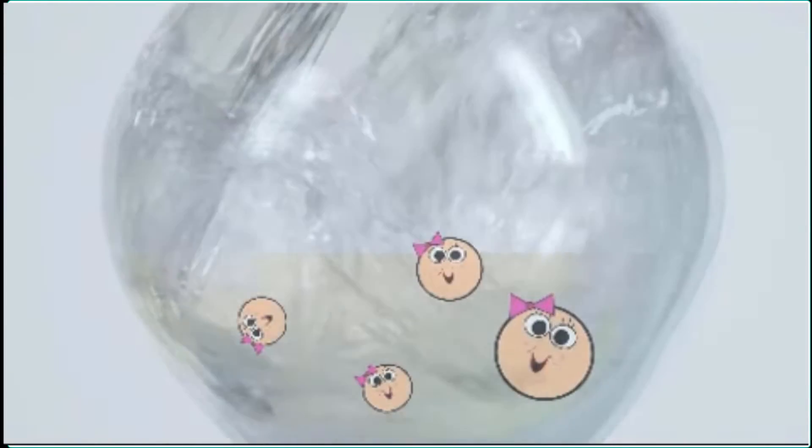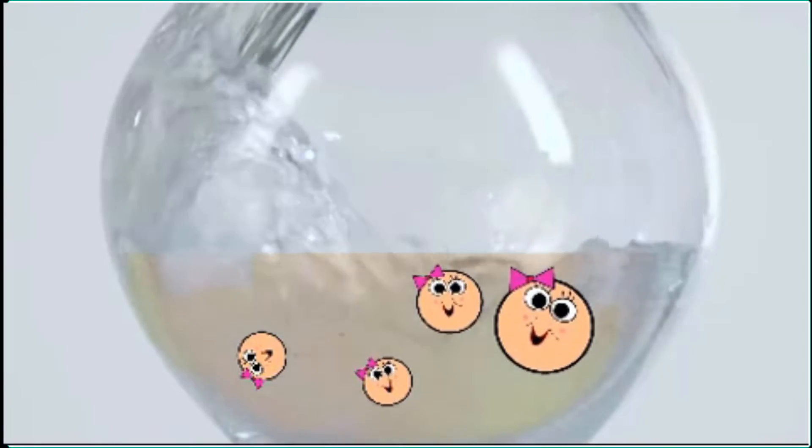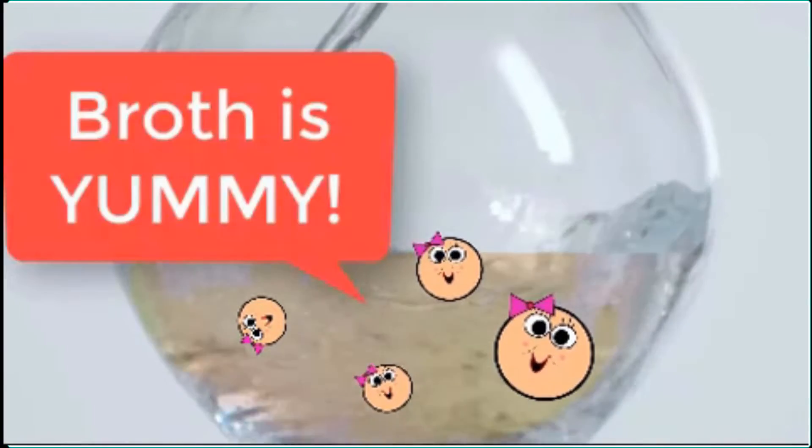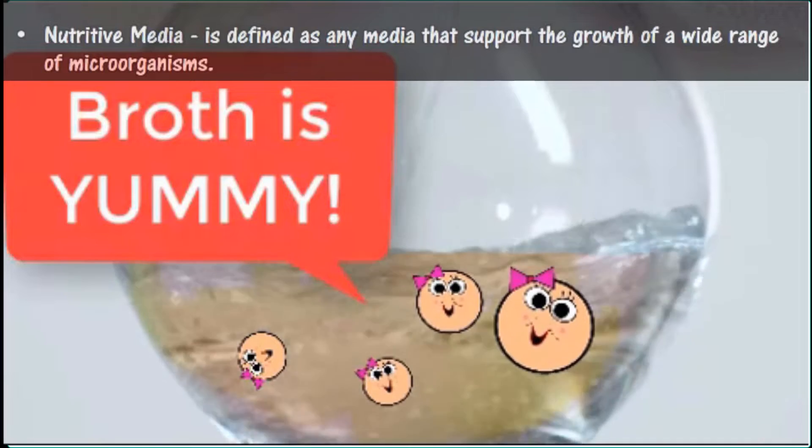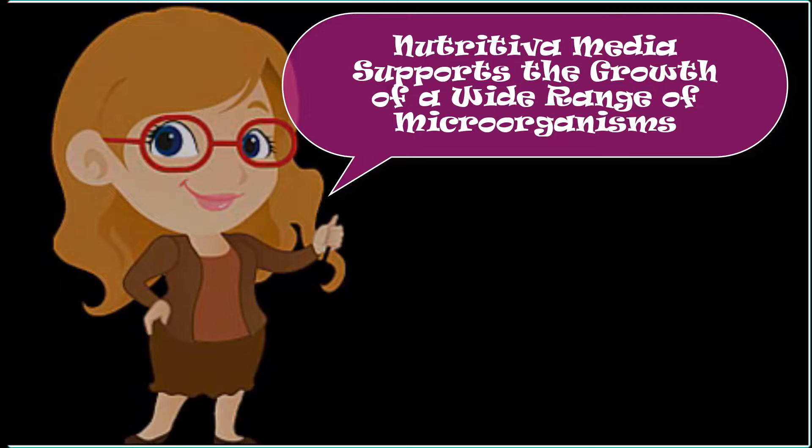And there are many other types of media as well. There is nutritive media, which is defined as any media that supports the growth of a wide range of microorganisms. This is often what we are using in the lab.